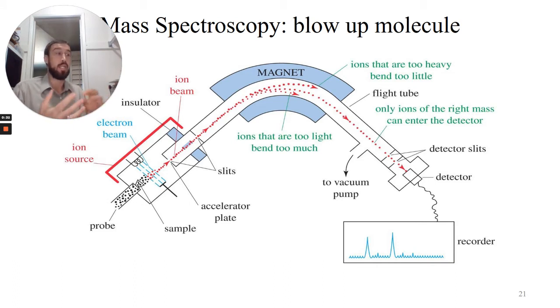You're looking at the analysis of the exploded parts. A lot of CSI investigators, bomb experts, will go through and look at the aftermath of an explosion and be able to piece together where the bomb was located, how it was assembled, who made it even, because of the characteristic pieces. And so they're able to reassemble it. That's what a mass spectrometer does. Or the person that analyzes it, that's what they do, right?